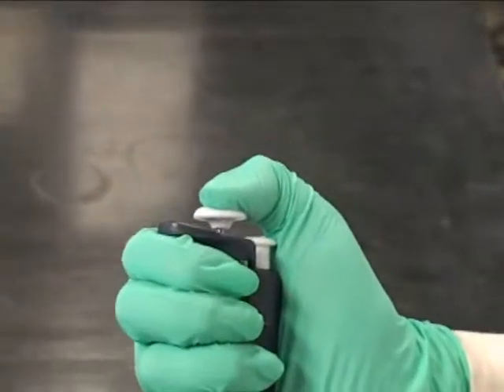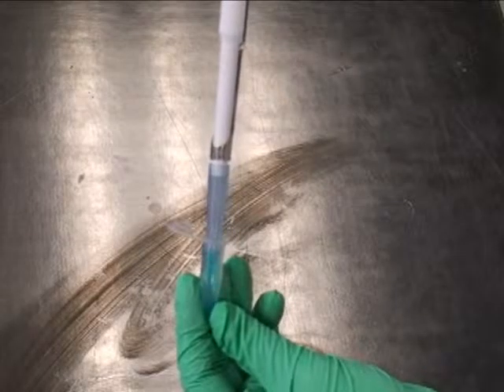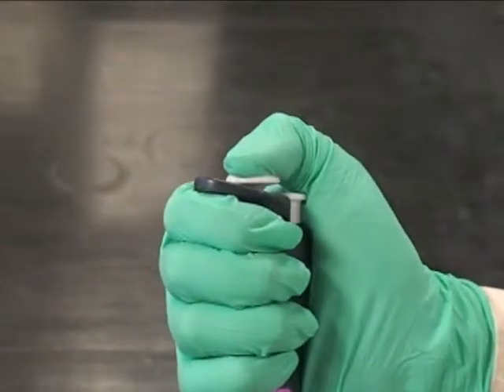Push the plunger down to the first stop and submerge the tip into the liquid. Slowly let out the plunger. To pipette the liquid out, push the plunger down to the second stop.